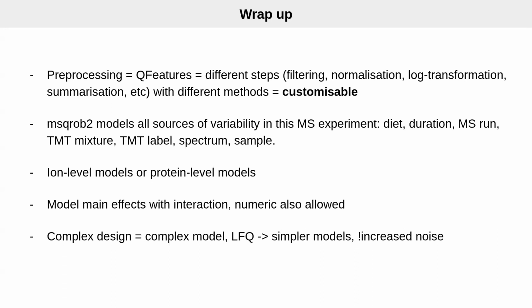Something that is also quite specific to msqrob2 is that, as a backend, we rely on the lme4 package functionality, which allows for a very flexible experimental model specification. So here I illustrated how you can include interactions with factors, but you can also have numerical variables. If you want, you can include splines. I mean, if you fancy that.